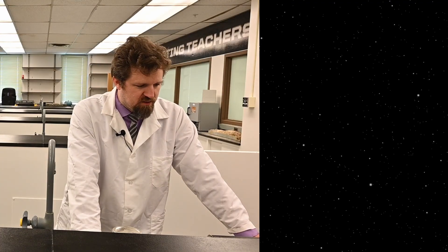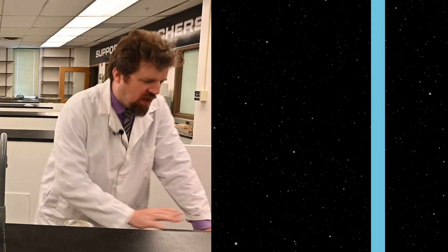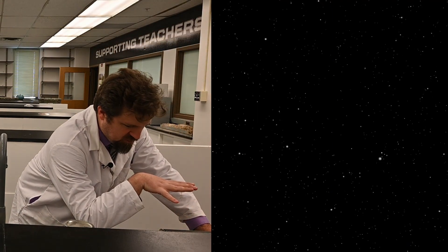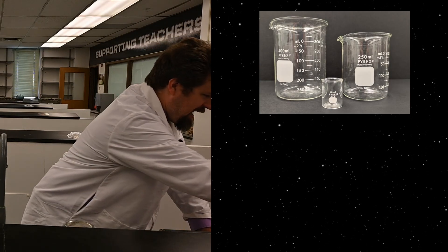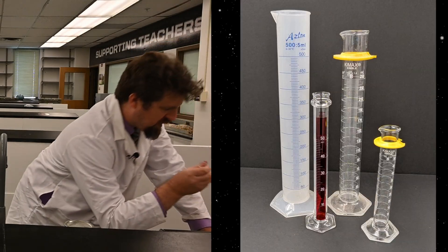Let's specifically talk about some common glassware you're going to come across in the lab. I think the big three of the glassware you're going to see in the lab would be the beaker, the flask, and the graduated cylinder.